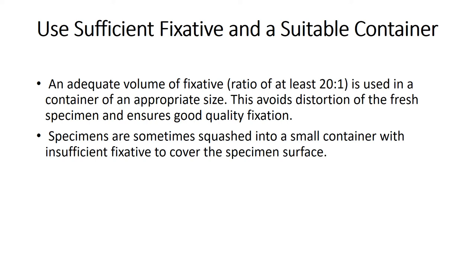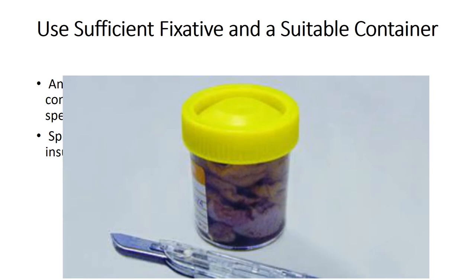Use sufficient fixative and a suitable container. An adequate volume of fixative — at least a 20:1 ratio — should be used in a container of appropriate size. This avoids distortion of the fresh specimen and ensures good quality fixation. Specimens should not be squashed into smaller containers with insufficient fixative. Sending specimens in syringes or small containers without proper fixative can result in autolysis and difficulty retrieving the specimen.